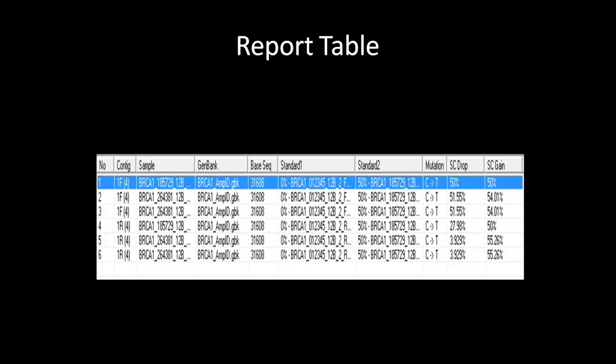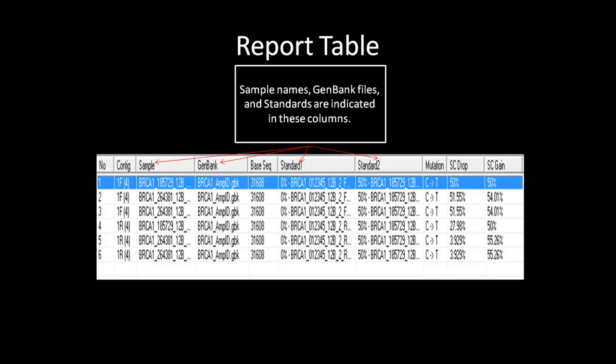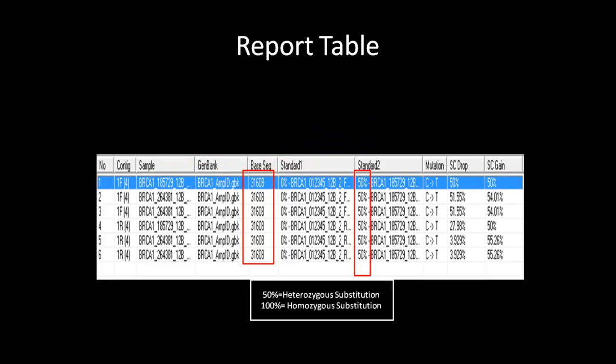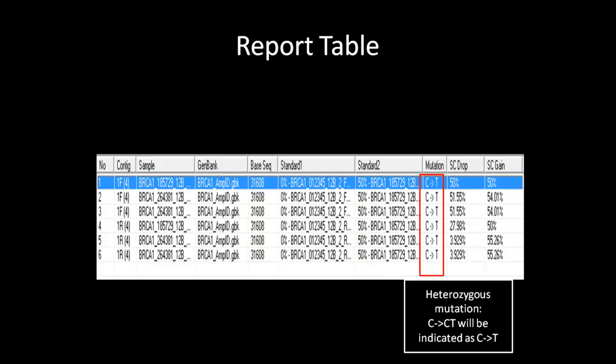The report table will generate with all the relative information from the quantification. The sample names, GenBank file, and standards used for the quantification are specified in these columns. You can sort these columns by clicking on the column header. The base position of variation are specified in this column. Within the standard 2 column, you can tell what type of substitution occurred at the indicated position. 50% indicates heterozygous substitution and 100% indicates homozygous substitution. You can also look at the Mutation column to see the base change for the specific variation. For a heterozygous substitution, the report will only display the mutation nucleotide change — for example, a C to CT change will only display C to T change in the report.